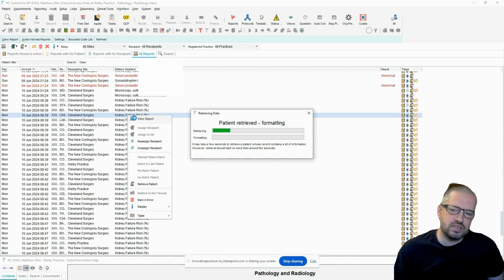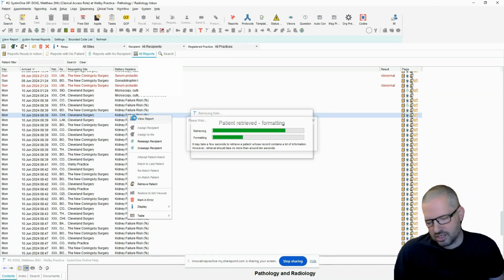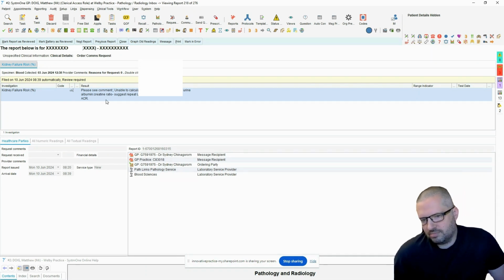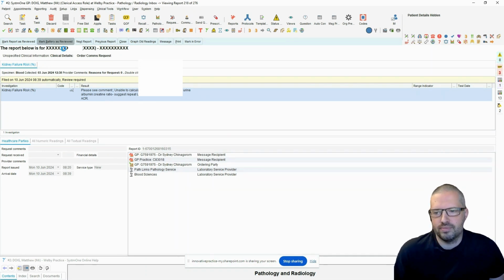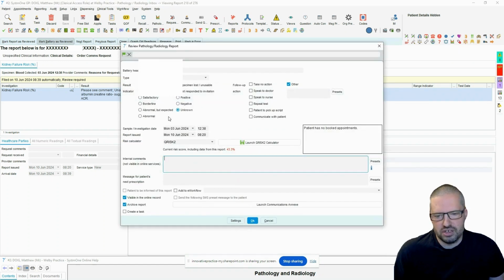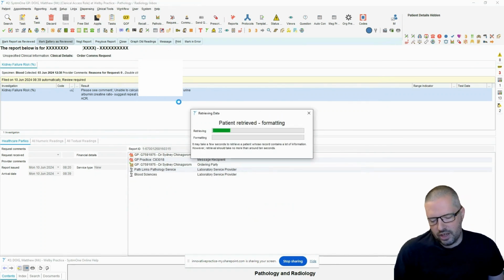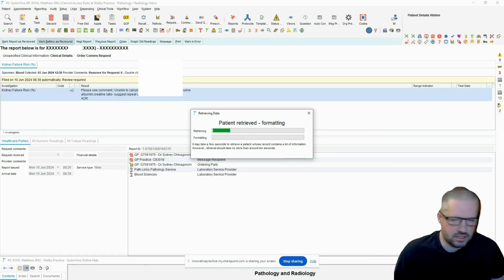And anyway, our systems can calculate the KFRE in the background based on the latest EGFR and latest ACR. Again, if you want that running in the background as part of your pathology system, let us know and we can enable that. So, I mean, this is useless. There's no result. It's unknown other because there is no actual result there. But we will have calculated a KFRE in the background for that patient if it's indicated, that is, if there's an EGFR that's less than 60.